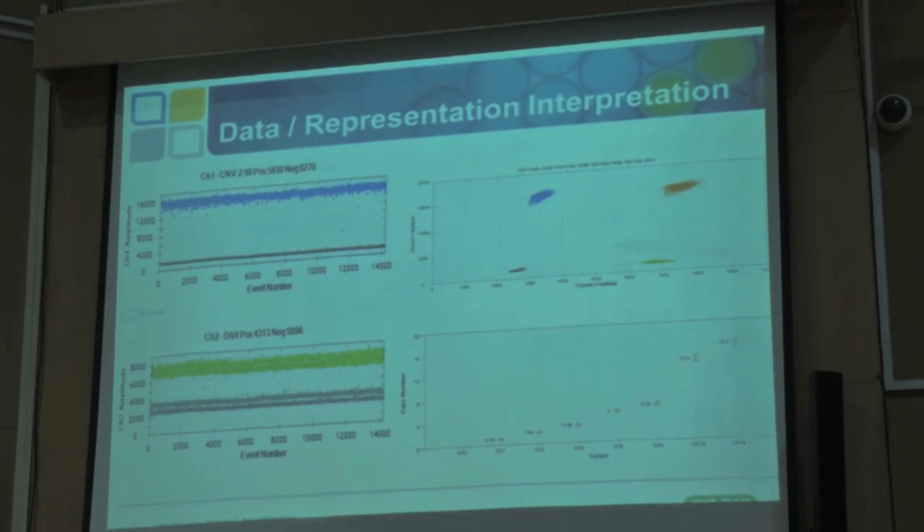Sorry, yes ma'am? For a multiplex? At least a 30 to 50 base pair difference, if you have to go more than 2 plex assays.